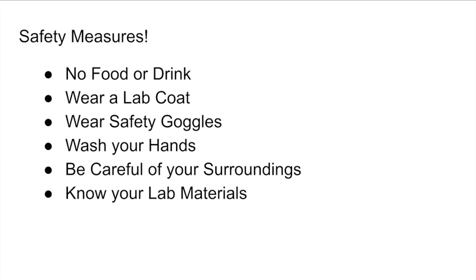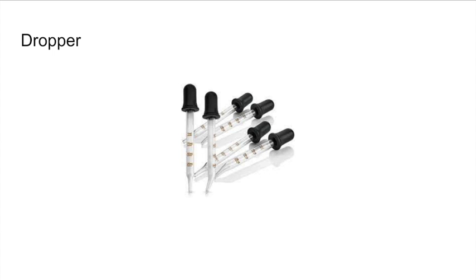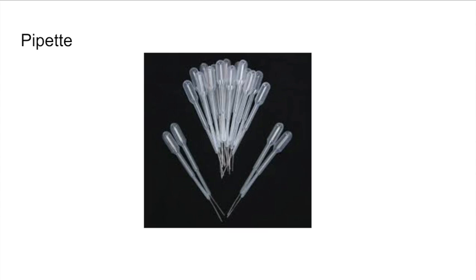So now we'll be having Elijah with the dropper. The dropper is a pipette consisting of a small tube with a vacuum bulb at one end for drawing liquid in and releasing it a drop at a time. It is a less controlled version of the pipette, however, as it has a wider end that lacks precision. They are used in the laboratory and also to dispense small amounts of liquid medicines. A very common example of this would be to use it to dispense drops of medicine into the eye.